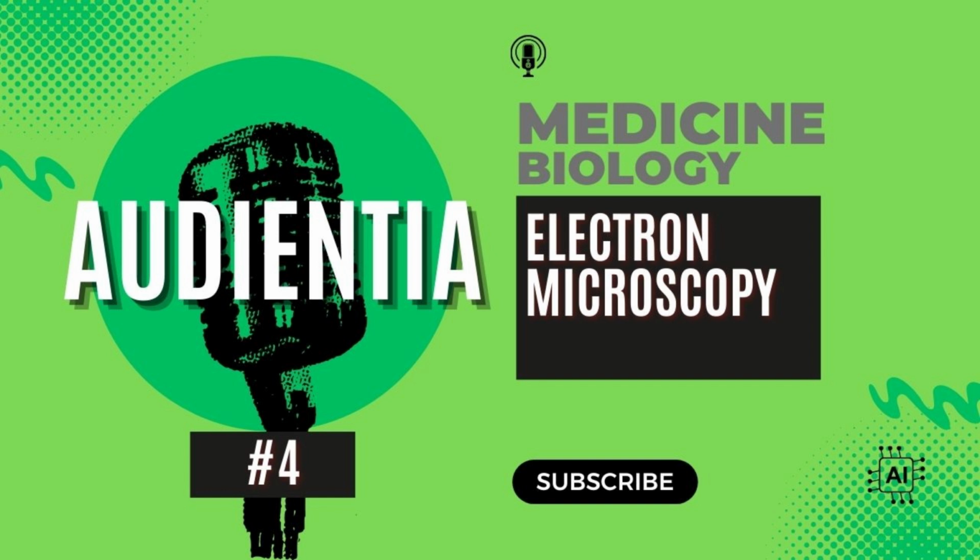Hi Emma, I've been reading about microscopy techniques, but I'm curious. Why do we use electron microscopy? Excellent question. We use electron microscopy, or EM, to study structures within cells that are too small to see with light microscopes. Electron microscopes allow us to visualize cell organelles, macromolecules, viruses, and even subcellular structures in incredible detail.